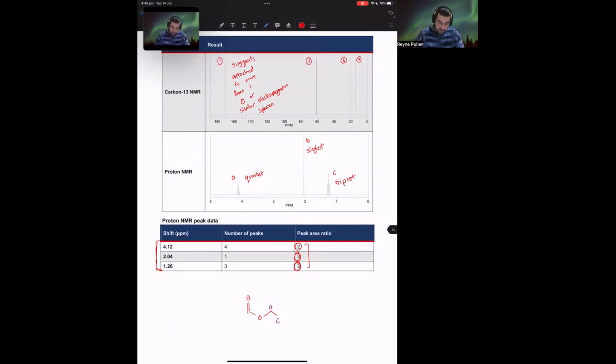And with that information, we can finish up the last piece of the puzzle, that there must be an additional terminal carbon off to the left there. And that must be proton environment B. It's a singlet, meaning that the carbon next to it has no protons present. And that makes sense. That carbon's already used up its 4 bonds. It's got 2 bonds to the carbonyl, 1 bond to the oxygen, and then it's got 1 bond to the terminal carbon. For completion's sake, let's then match our carbon environments to this as well.